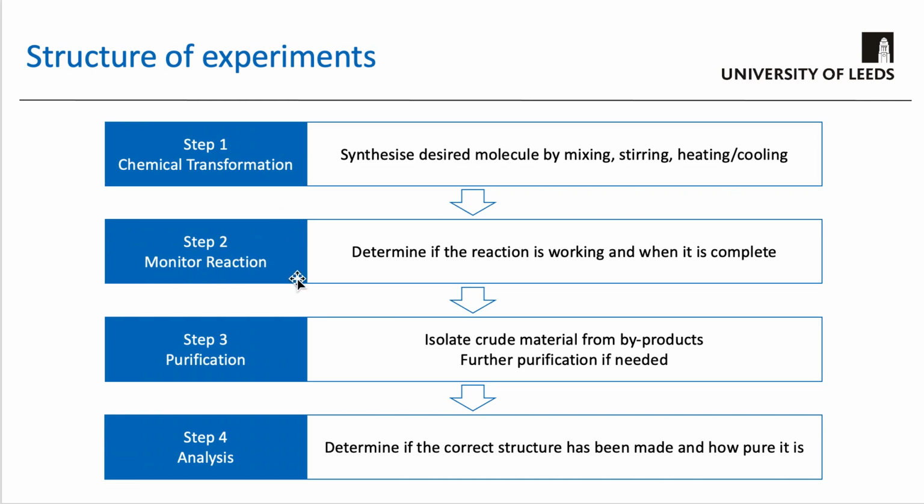So rather than just stirring things for a fixed amount of time and then moving on to the purification stages, without really understanding what's happened in the reaction, it's quite important to monitor the reaction, and you're going to be using TLC as the main technique to be able to do that in this reaction.